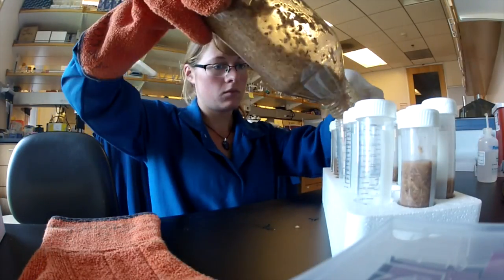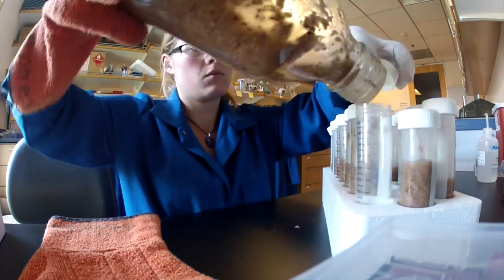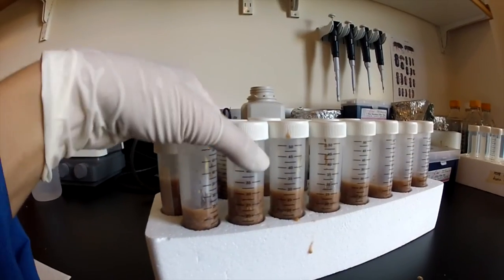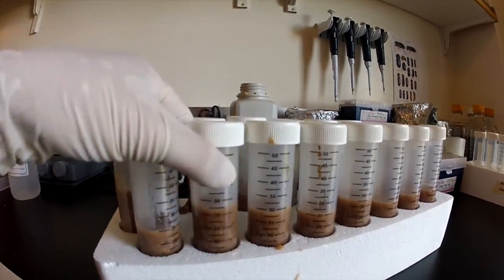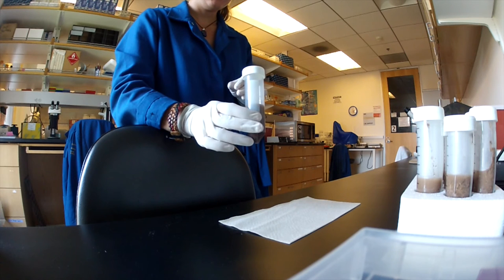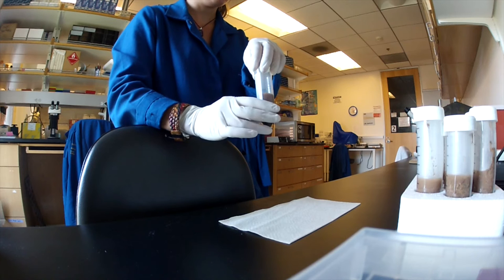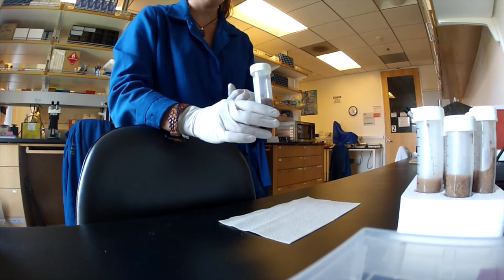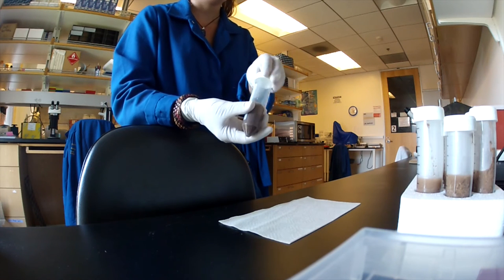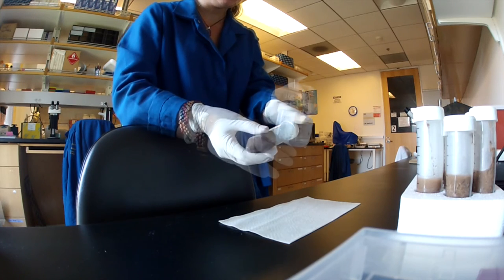After you've poured your tubes, try to tap out any air bubbles that may have formed by tapping the bottom of the tube against the bench. You'll notice that condensation starts to build up in your diet tubes after pouring from the autoclave. After you pour, wait about a day, and the next day you'll have to tap out the condensation so that the tubes dry out enough to put the beetles in them.